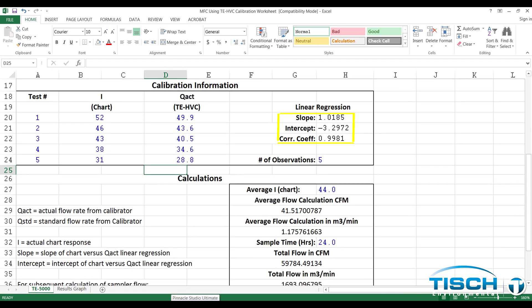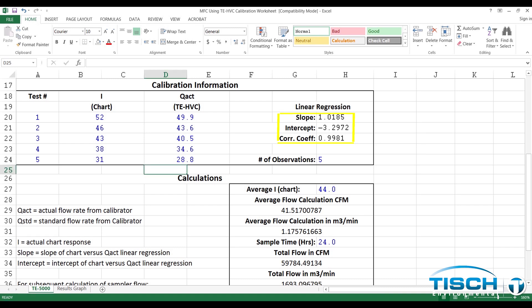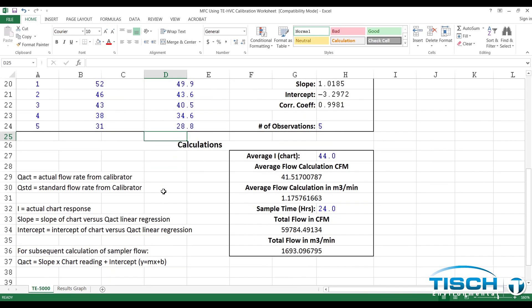Our slope is 1.0185 and the intercept is negative 3.2972. Our correlation coefficient is 0.9981, which is a good calibration. Anything under 0.990 is a bad calibration. After a completed sample, the user will need to enter the average chart reading and the sample time in hours to calculate the total flow in cubic feet per minute and total flow in cubic meters per minute.